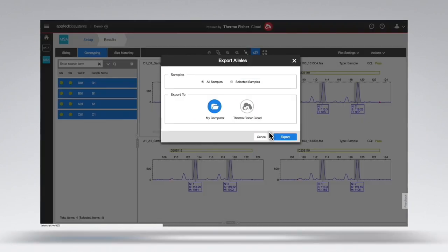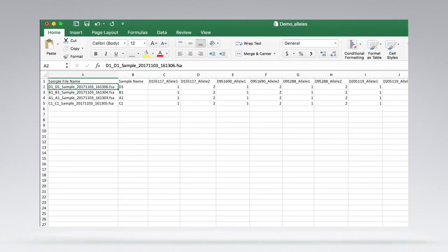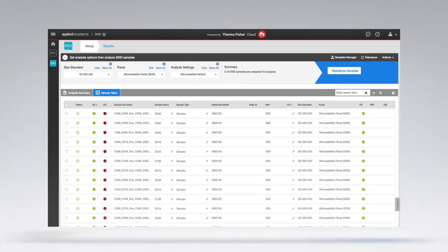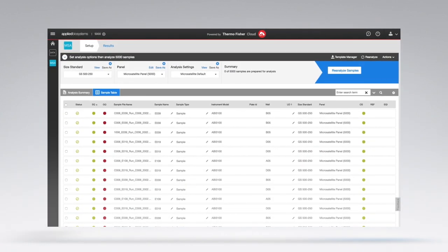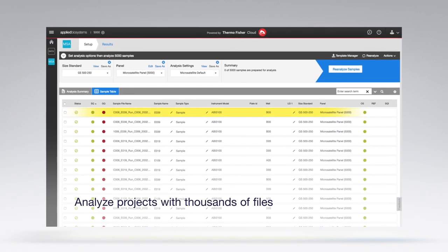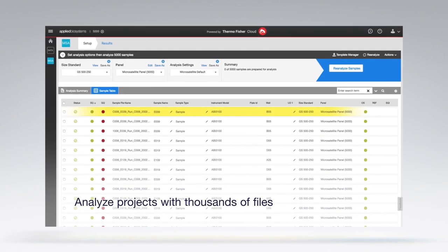The export formats are consistent with GeneMapper software to maintain your legacy integrations. With the power of the cloud, you can analyze projects with thousands of files.